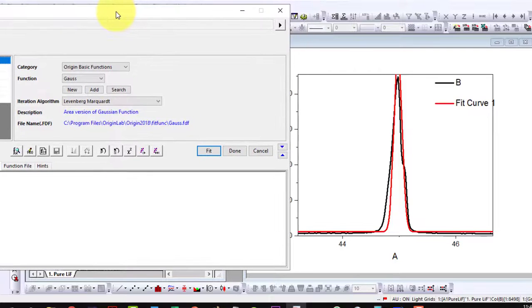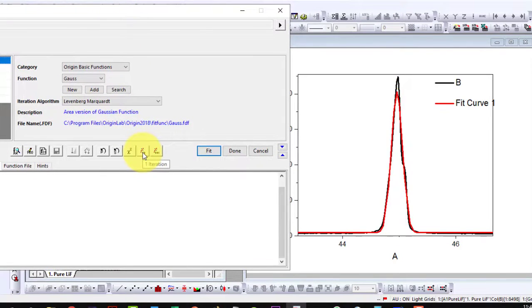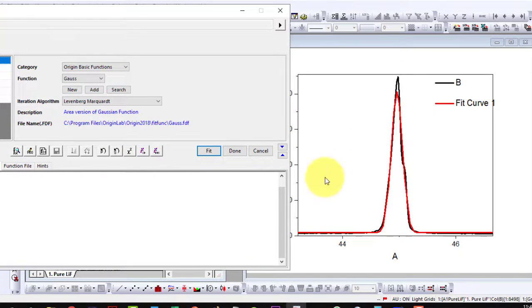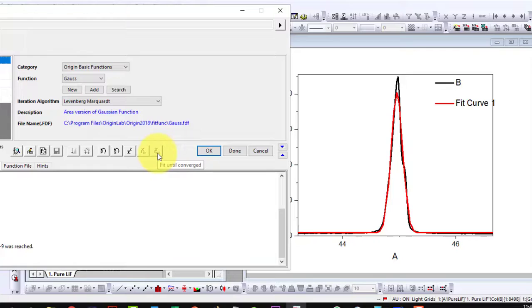Let's move it here. This is one iteration. I apply it for a couple of times in order to see how the fitting proceeds and then finally I will click this fit until converge and it is done here.